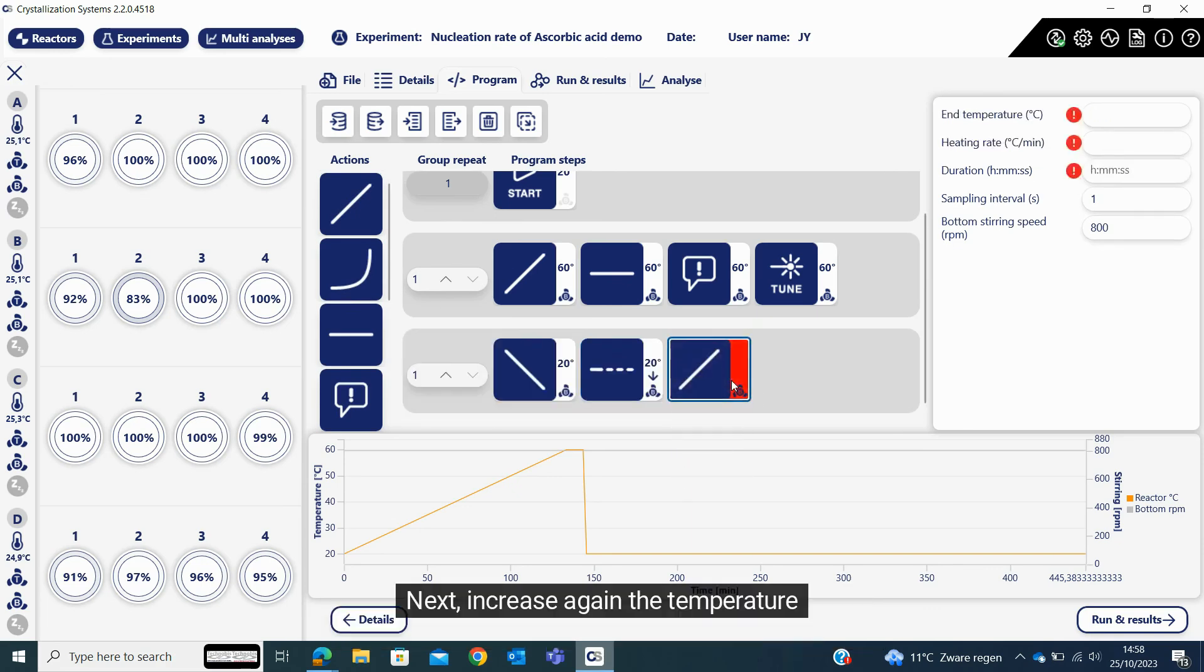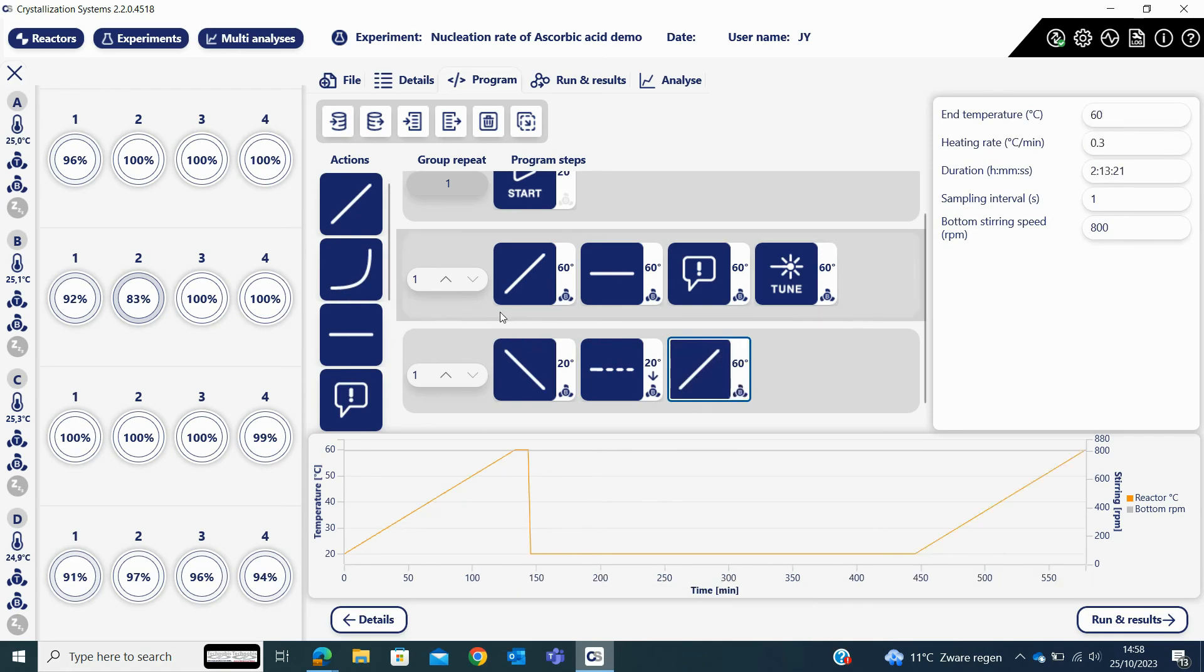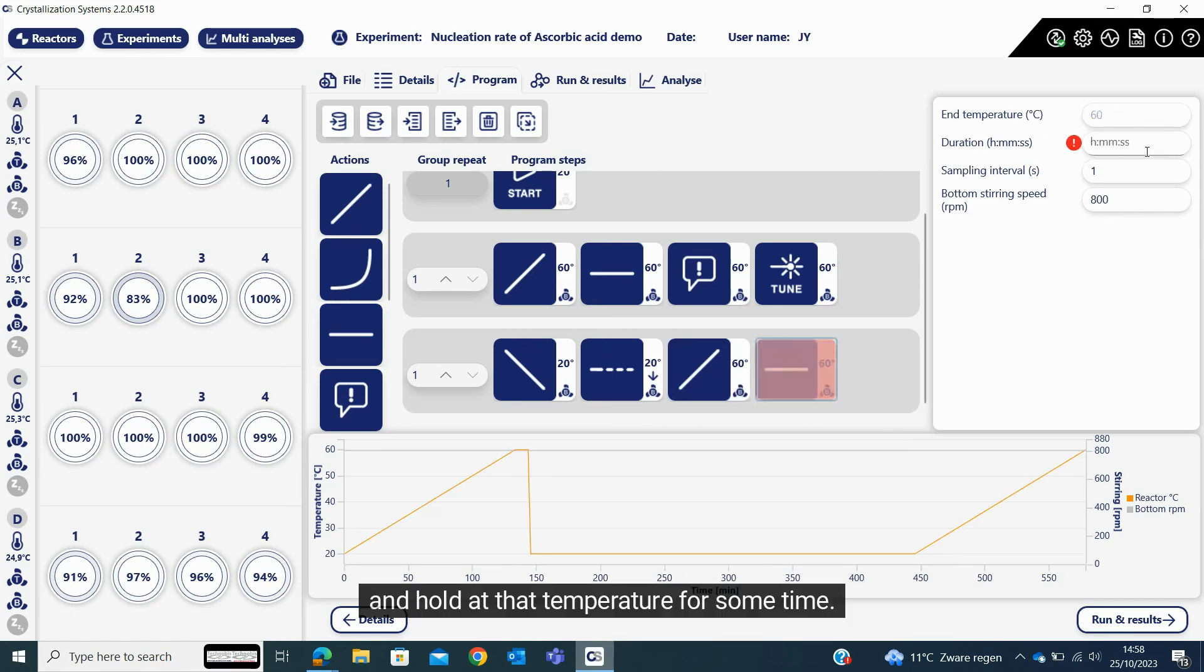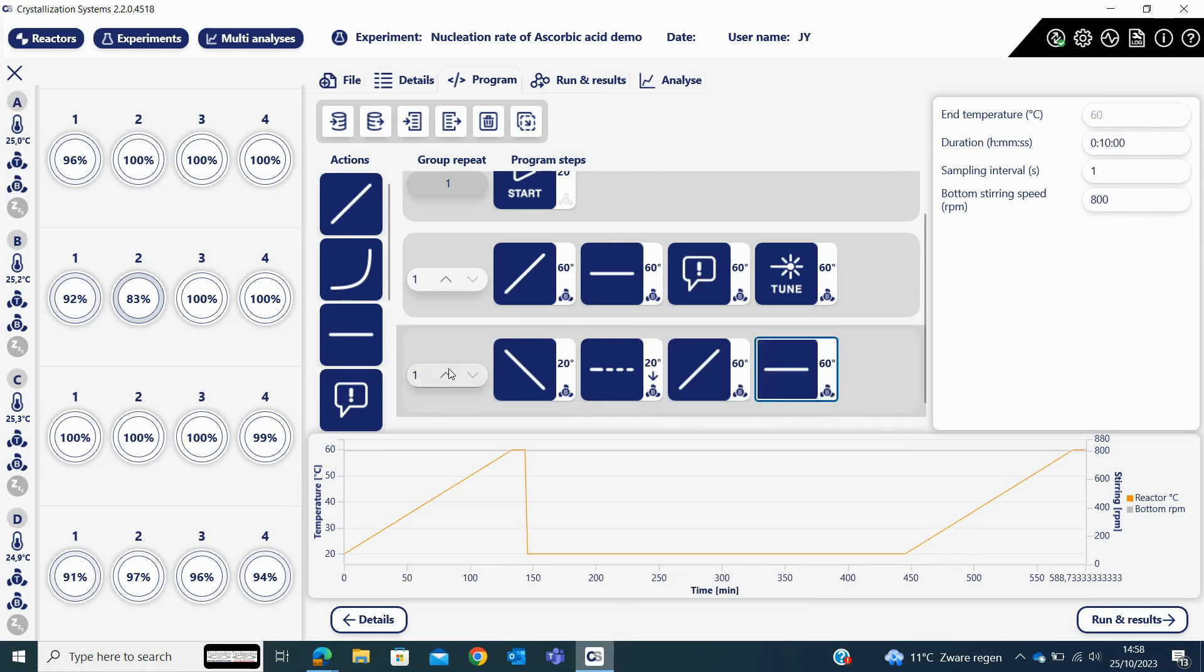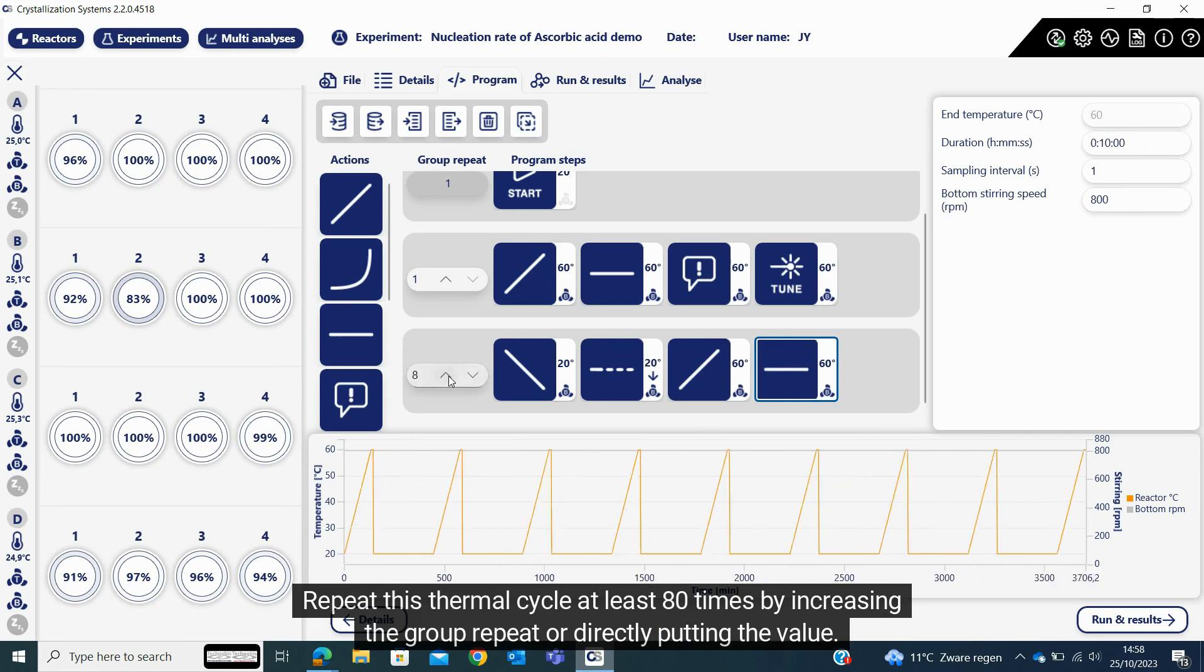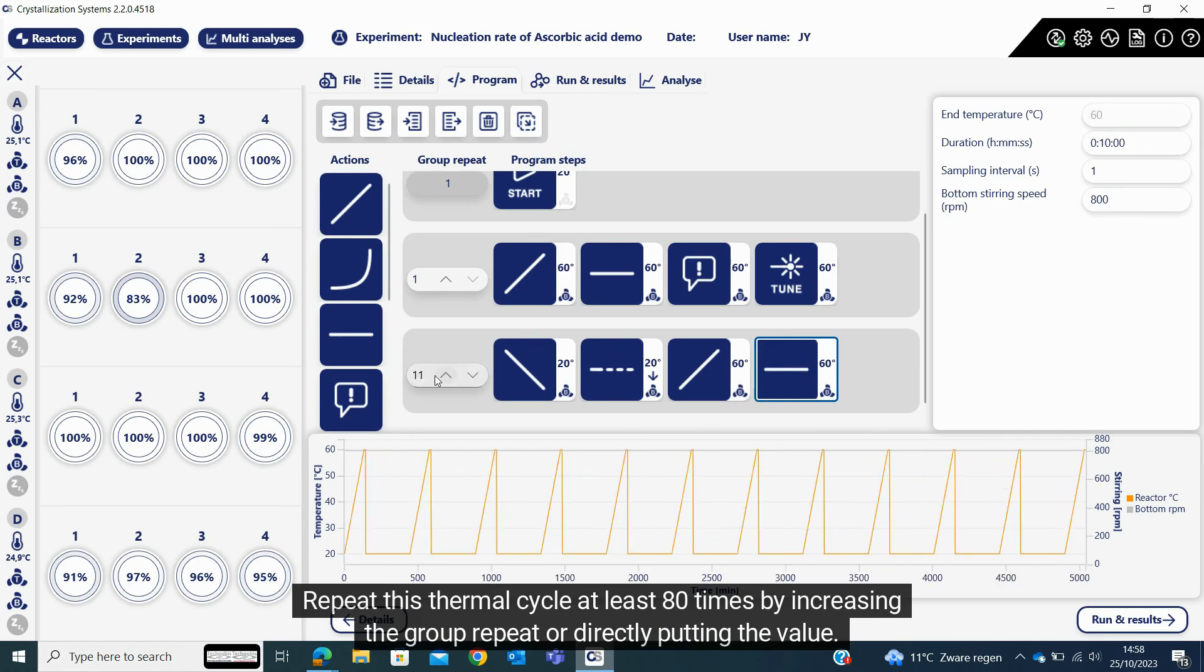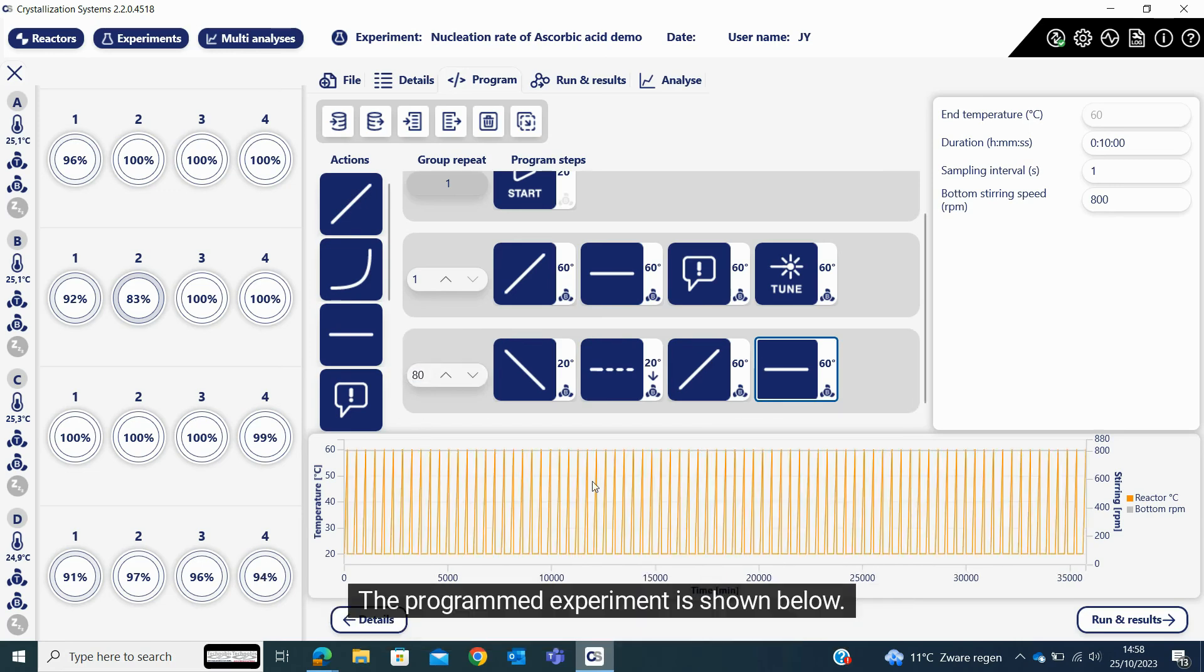Next, increase again the temperature at a slow heating rate and hold at that temperature for some time. Repeat this thermal cycle at least 80 times by increasing the group repeat or directly putting the value. The programmed experiment is shown below.